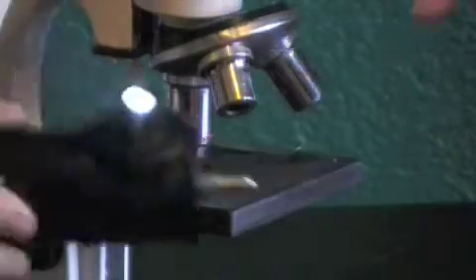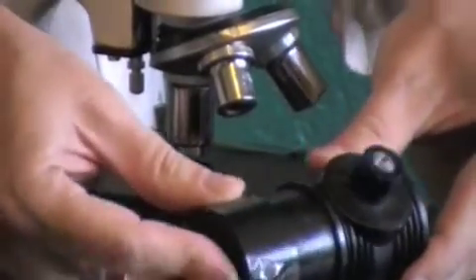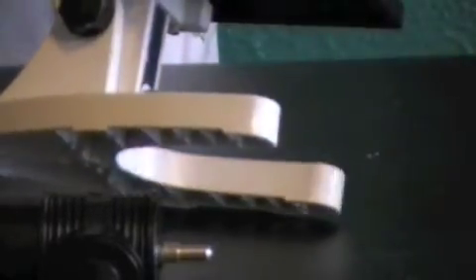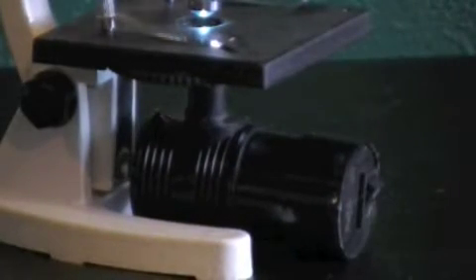Excuse me. Make sure you're pointing the light in the right direction. So you've got your light source here. You can turn it on and off. To put this in, what you're going to do is grasp your mirror, pull your mirror out of the slot, replace it with your light source, make sure it's pointing up through the hole, and you're ready to go. So this means you're all ready to look at your slides as soon as your brine shrimp are finished. We'll show you how to prepare a wet mount for that so you'll be able to see them.